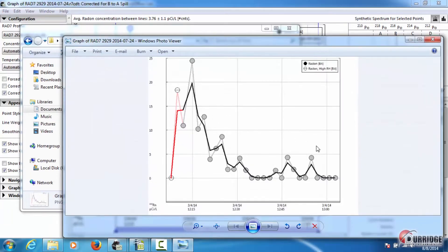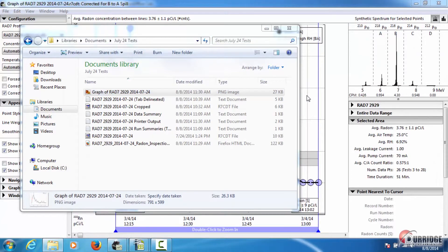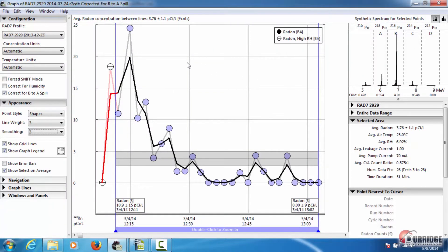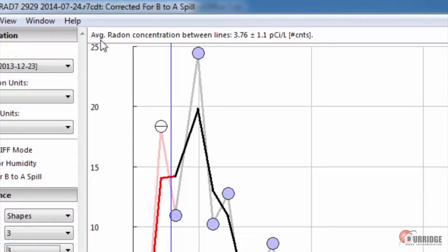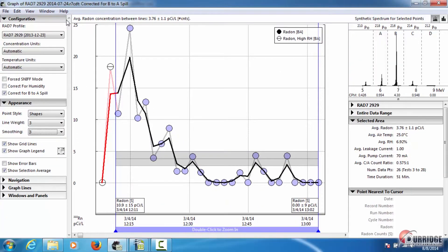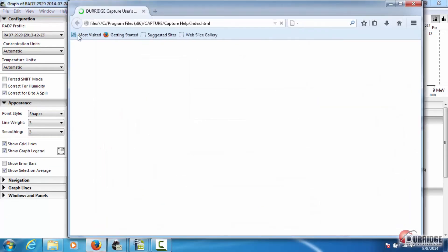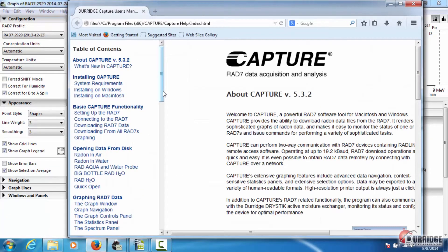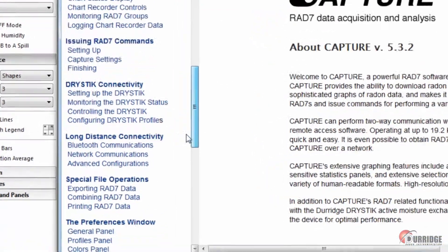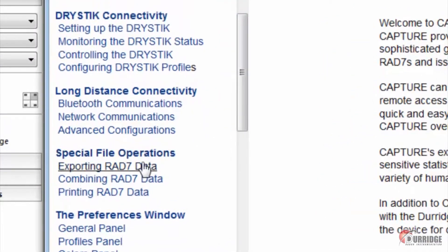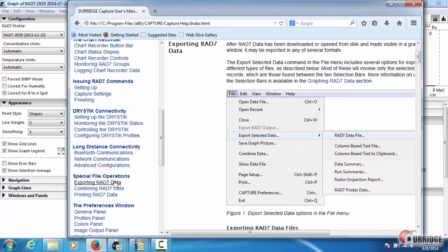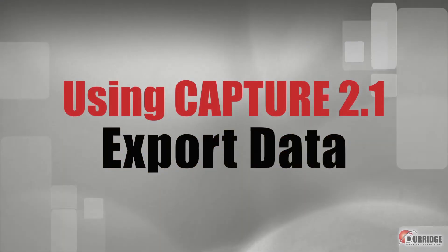Those are the methods of exporting data. If you want to read about them in more detail, you can go to the Capture User Manual by clicking Help > Capture Help, and then under the heading Special File Operations, see the subheading Exporting Rad7 Data.